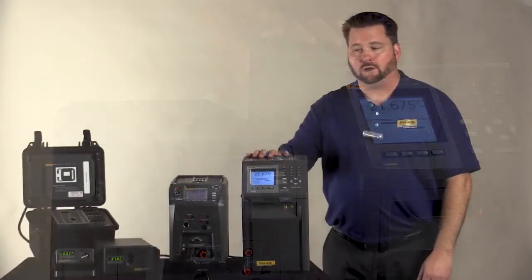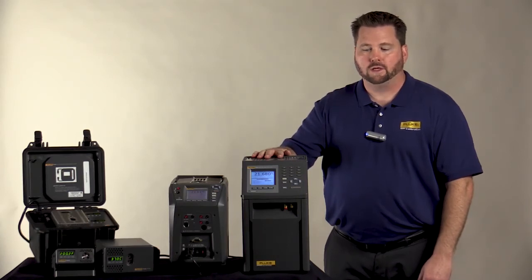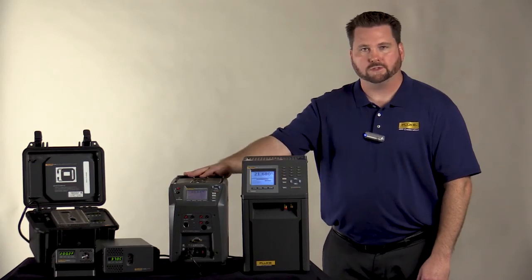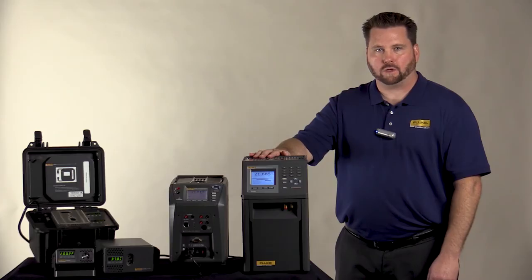Typical accuracy on our 914X units is 0.2 degrees C, while our 917X series is accurate to 0.1 degrees C to the display. To further improve upon this, each unit can be ordered with reference options or process options. This allows you to connect an external reference probe, allowing you to further improve your uncertainty. All of our drywell units come with either a traceable calibration certificate or ISO 17025 accredited calibration. This allows you to feel confidence in the calibration work you are performing.